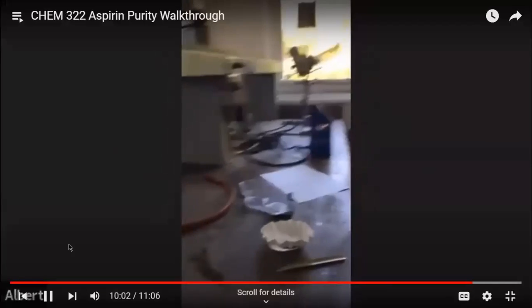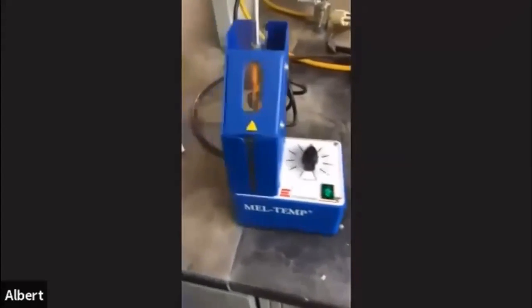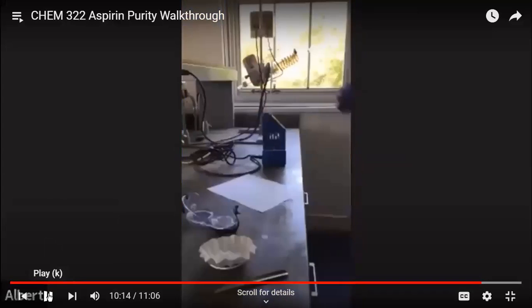So this is like watching paint dry. But I'm going to try to get another shot of all 3. If y'all can see that, she has all 3 of her samples loaded. So taking that melting point, it's actually a very tedious process. And I've been teaching this class, oh my gosh, I don't know how many years. And it never fails that somebody will drift, stop paying attention, look up, and your sample is melting. So it requires a lot of attention.